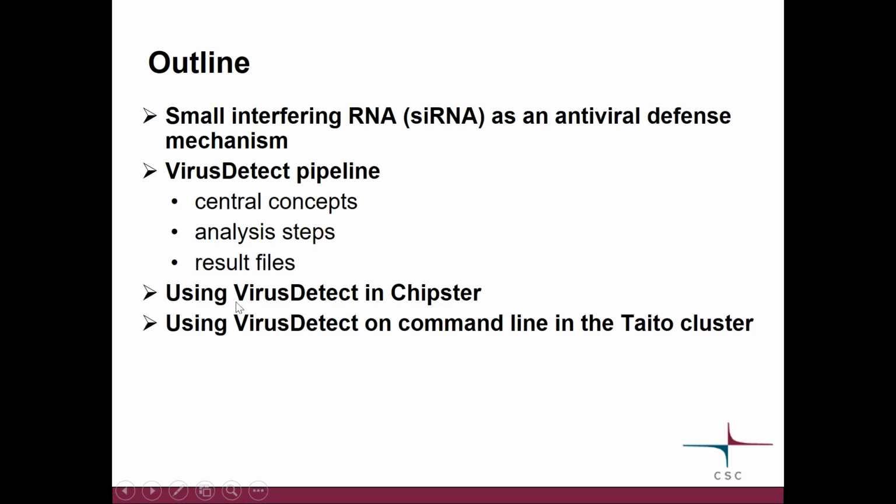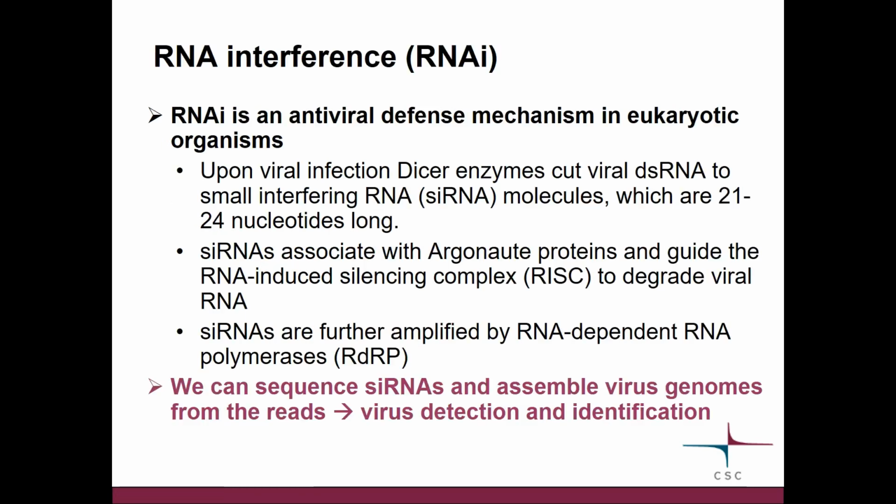Then I will introduce you to how to use this tool in the graphical Chipster user interface, which you can operate with mouse. And after me, Kimmo will tell how you can use VirusDetect on command line. So if you prefer, if you're comfortable working on command line, perhaps doing even some programming, then using command line on the Taito cluster might be the way for you. But let's start with the background first.